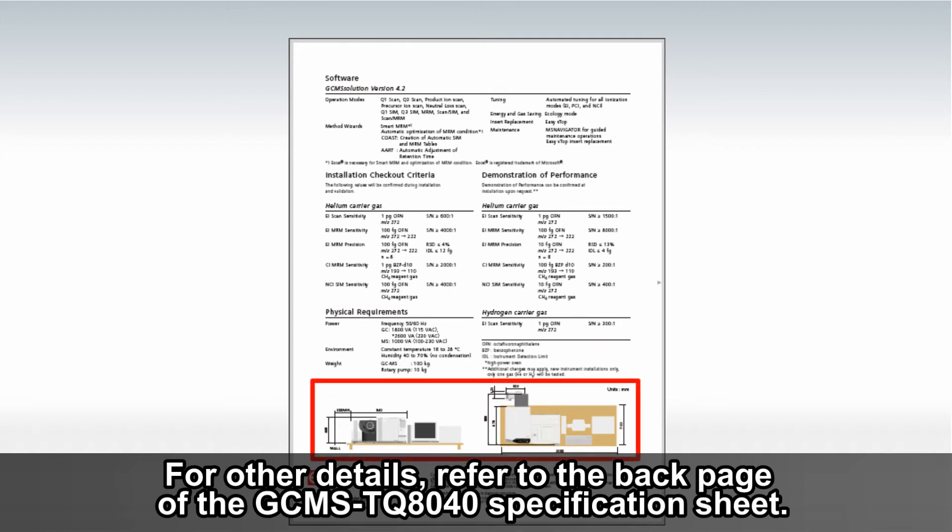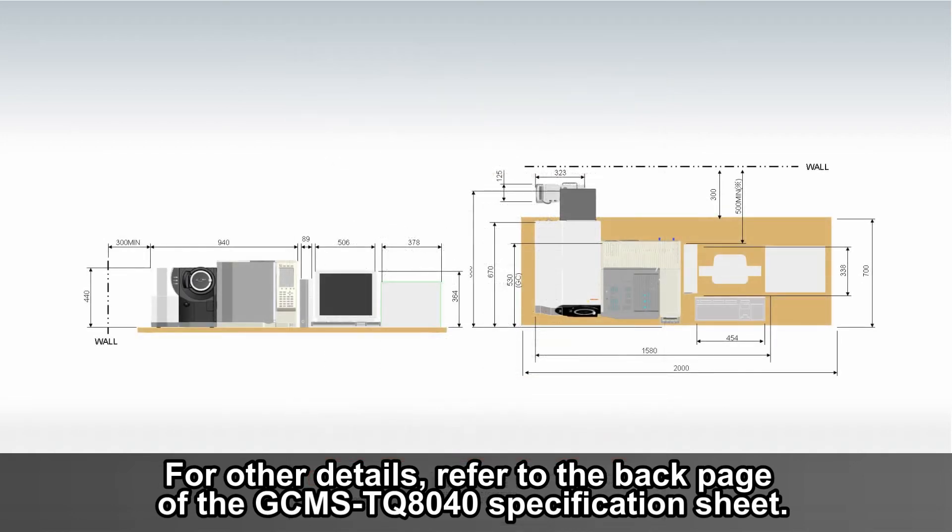For other details, refer to the back page of the GC-MS TQ8040 specification sheet.